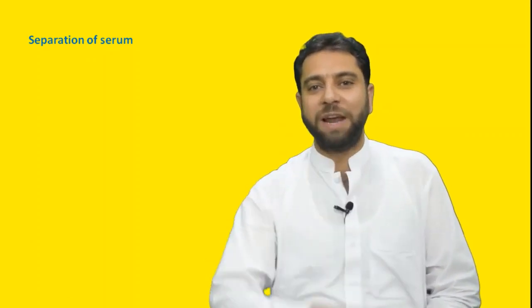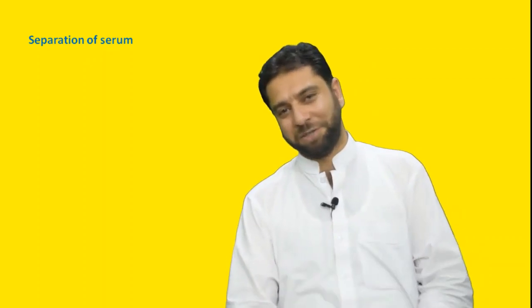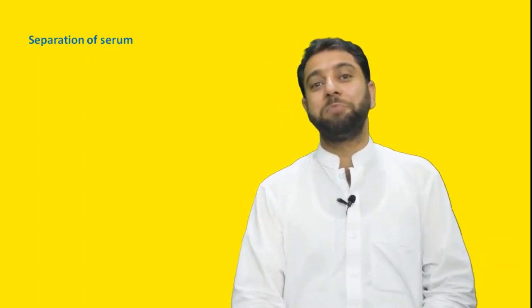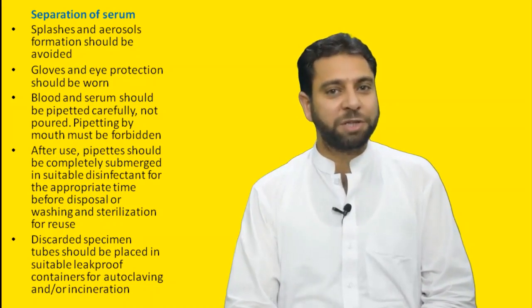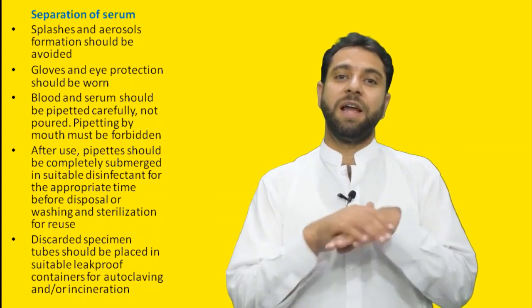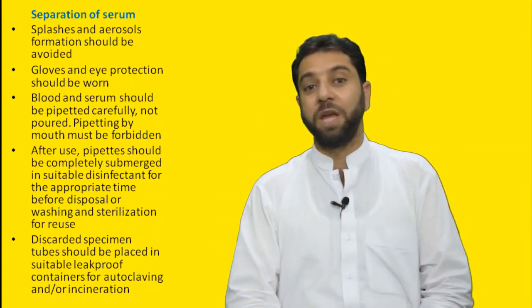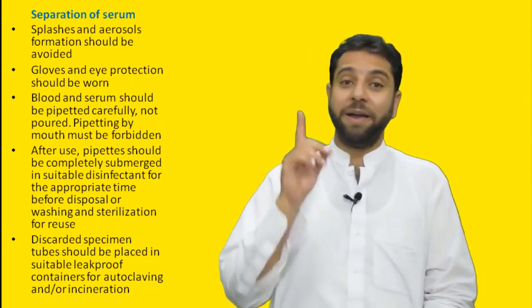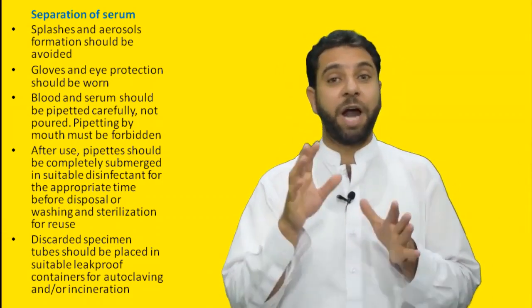One of the very frequent and routine work in lab is serum separation. During the separation of serum, splashes and aerosol formation should be avoided. Gloves and eye protection should be worn. Remember that blood and serum should be pipetted carefully and not poured.